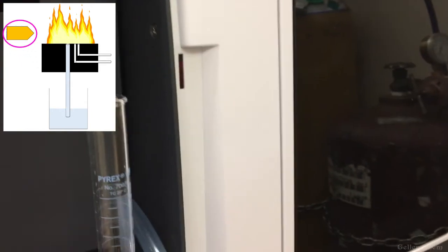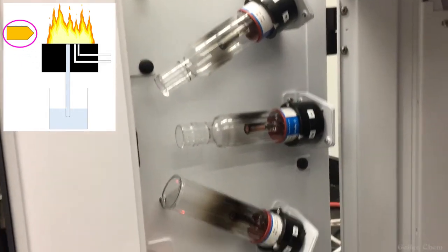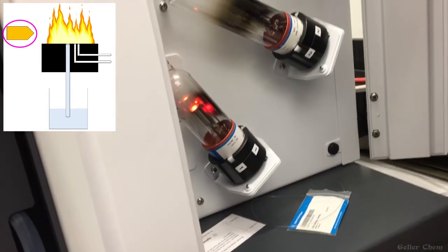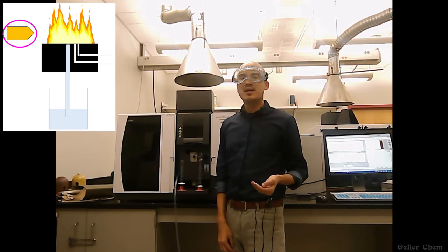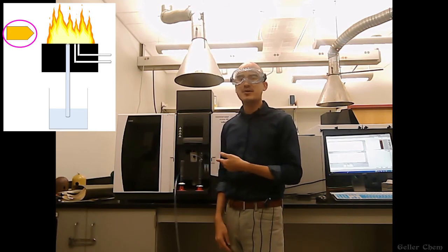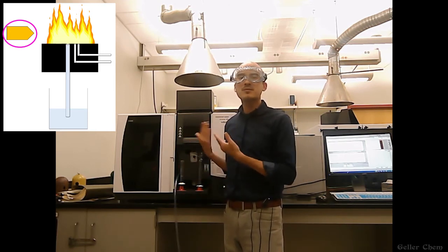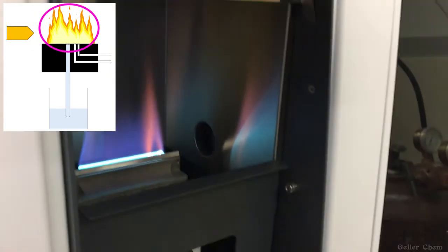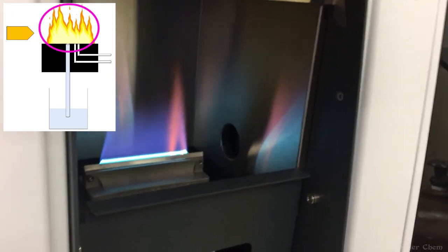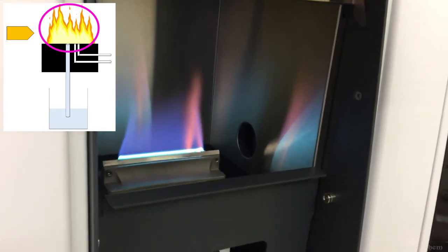Over here, we have 4 different hollow cathode lamps. The one that's currently activated, you can't really tell, but it says iron on it, indicating that if iron were actually in the sample we're currently aspirating, some of that light should be absorbed and we should see a signal. Finally, here's the flame. Okay, we can see it looks like a normal flame, some blue, some orange.